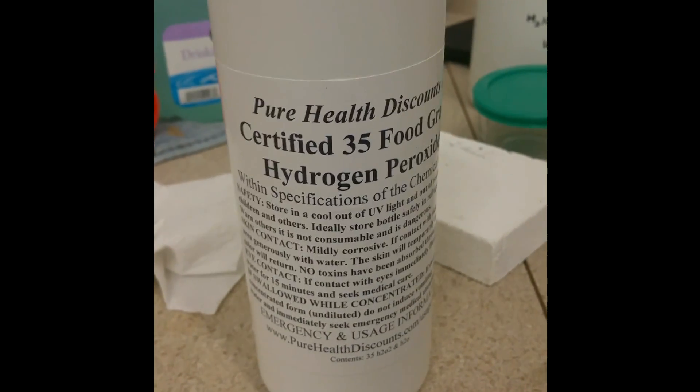The way I validated this method, beyond the Wikipedia standardized data, is using 35 percent food-grade hydrogen peroxide bought from Pure Health Discounts. It's legitimate stuff — it'll turn your skin white for hours, so don't mess with it. I did the same density calculation on it and calculated 31 percent, while they report 35 percent. So it's pretty close; you can imagine reasons why they'd differ slightly.